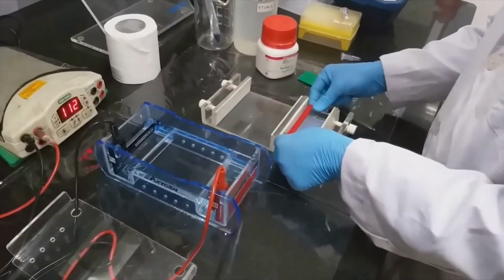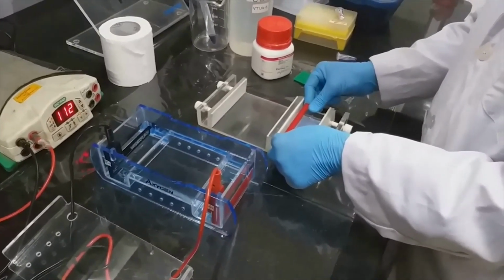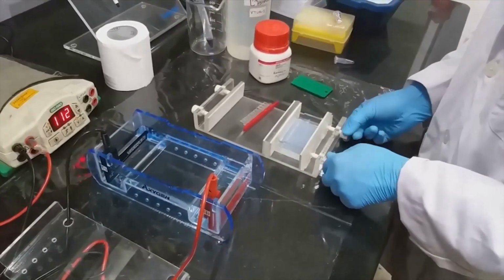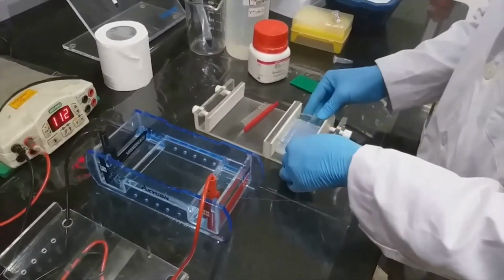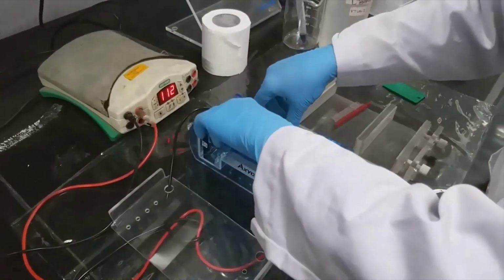We have to gently remove the comb, loosen the knobs, and keep the gel in the apparatus.